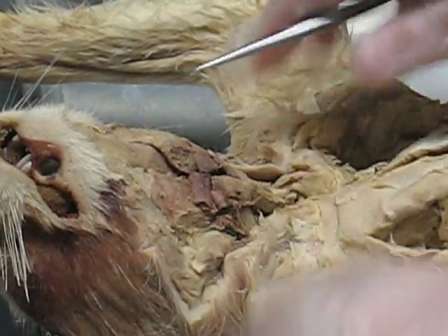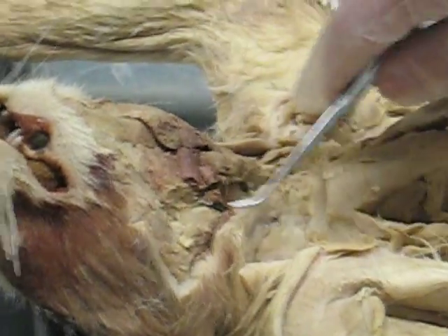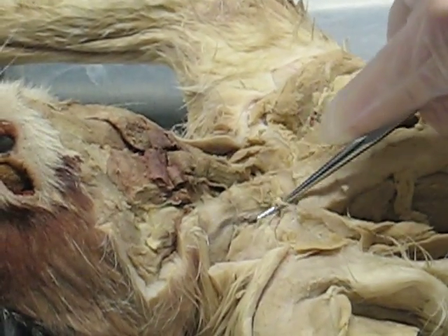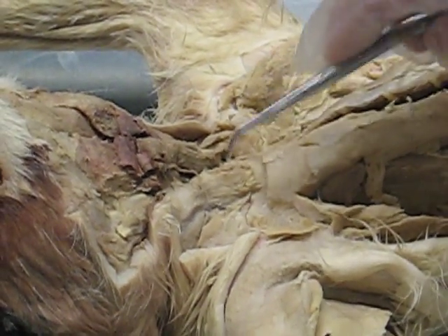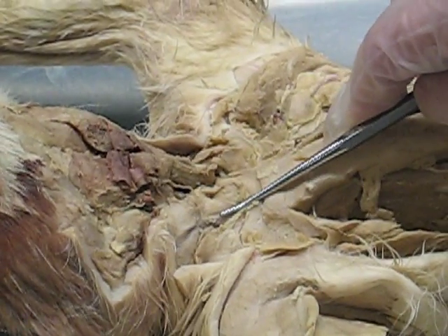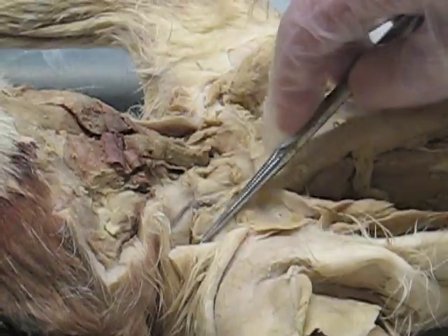This collar here is the sternomastoid. You see these flaps here? The outer one — the outer collar — is the sterno. And then you have the jugular vein. It should be more blue, but this is the jugular vein. It's sort of the boundary between the sternomastoid and the clydomastoid. The sternomastoid occupies the middle, and the clydomastoid is more on the lateral side of the neck.